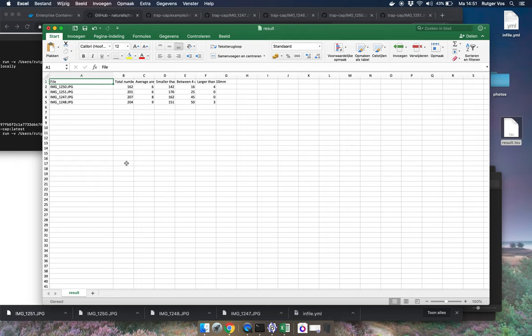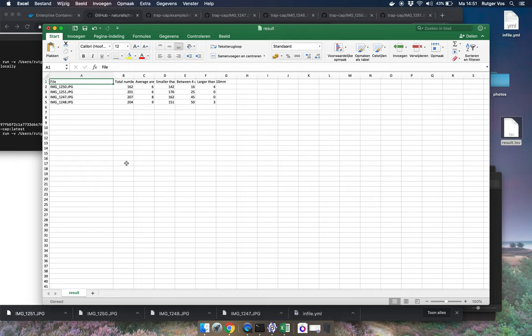So hopefully this gets you up and running so you can run your own analyses. And of course you can do this with many more than just four photos, basically as many as you like. And well hopefully this works for you. Okay best of luck, thanks.